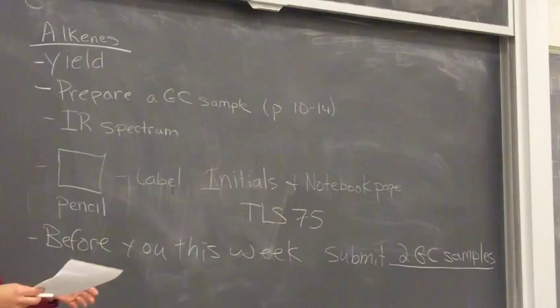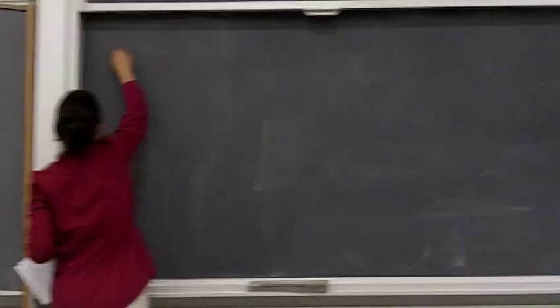So now, as far as GC, let's actually talk about what GC is. So GC is another form of chromatography. So we've talked about gel permeation chromatography. Now we're going to talk about gas chromatography. And that's what's covered in experiment 10.